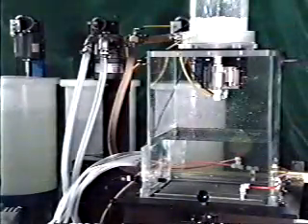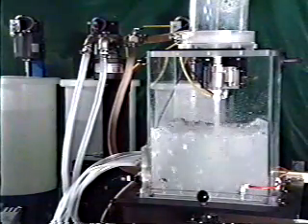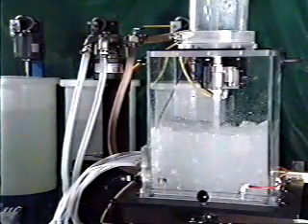Another feature of the sheet former is the thick stock pre-mixing tank, which allows you to make sheets at commercial consistencies. Chemicals and stock are mixed in the thick stock tank and then introduced directly into the deckle.